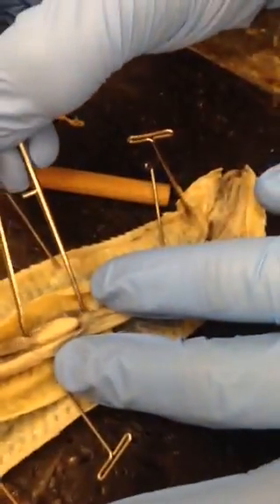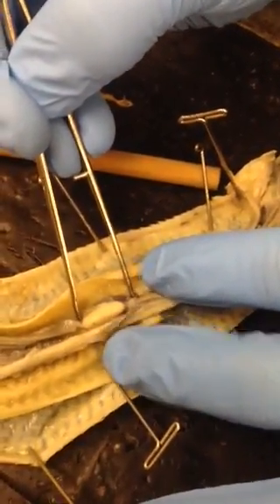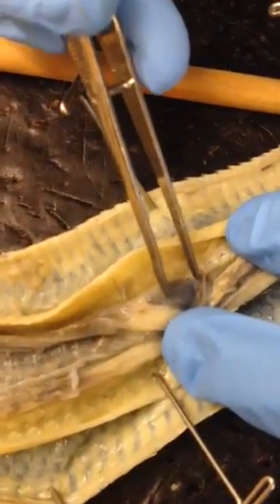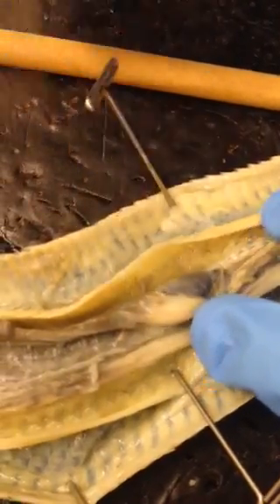Coming back up, we have the heart right here. This whole thing right here is the heart. This top piece is going to be your atria, and this bottom piece is going to be your ventricle.